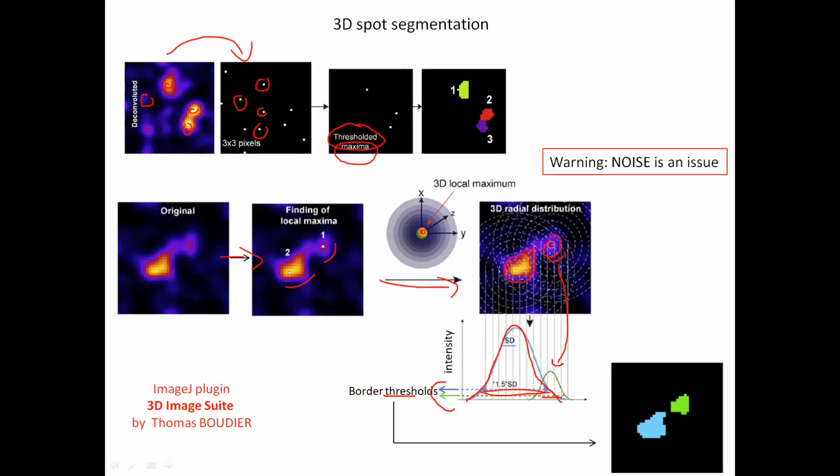Okay. So here, for example, I show you only two maxima. Obviously here or here there would be maxima, but they're not there because I applied a threshold. So only the maxima which are above a certain intensity will be kept. Because obviously in your image you will always have your object with a great signal, but you will also have some background, and you don't want to consider the background as an object. The second thing, we can talk about it in more detail later, but I will come back to that after we do the demo.